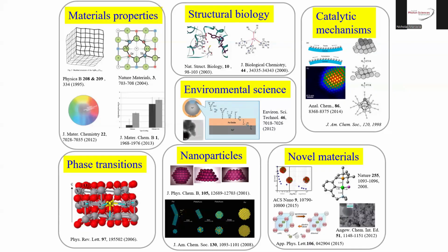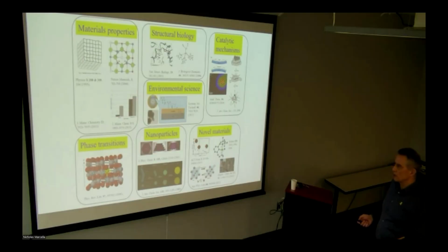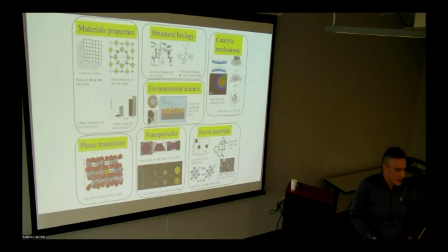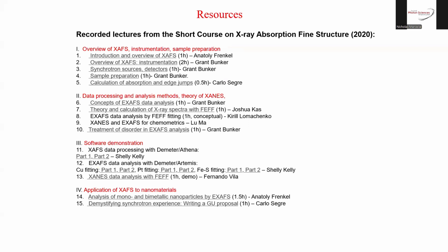Anything you want, you can probably understand from XAFS, but that's of course not true, because some materials don't have that interesting a question on the local scale, but you may not even be interested in trying.